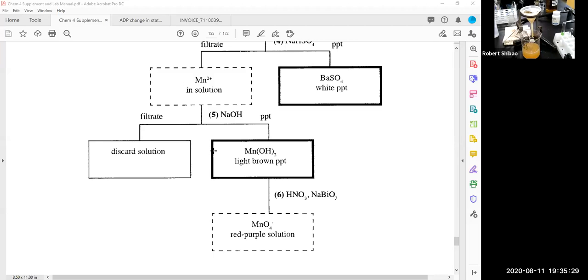I need to wash it. And so this beaker was pretty dirty. So I'm going to wash it with soap and the brush. See, I still have a lot of dishwashing to do. But I'll wash it with, I don't know if you can see that. I guess you can.